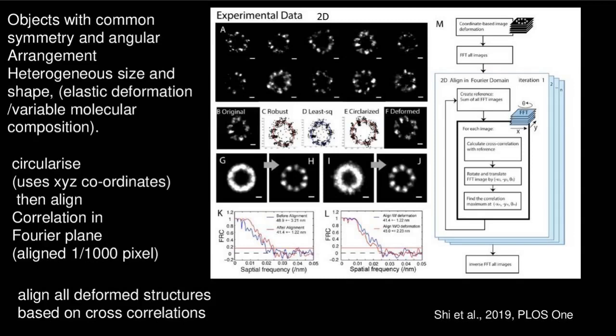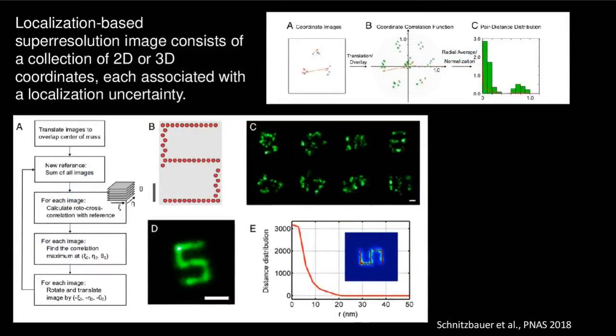And then I just wanted to mention this last one that was published quite recently, which is using a Fourier Transform based method, but it's also doing some sort of manipulation of these rings to make them more ring-like when they're not ring-like, so circularizing them before doing this transform. Okay, so there are a number of things out there, but none of them really do what we quite want. Oh, I've forgotten this one.